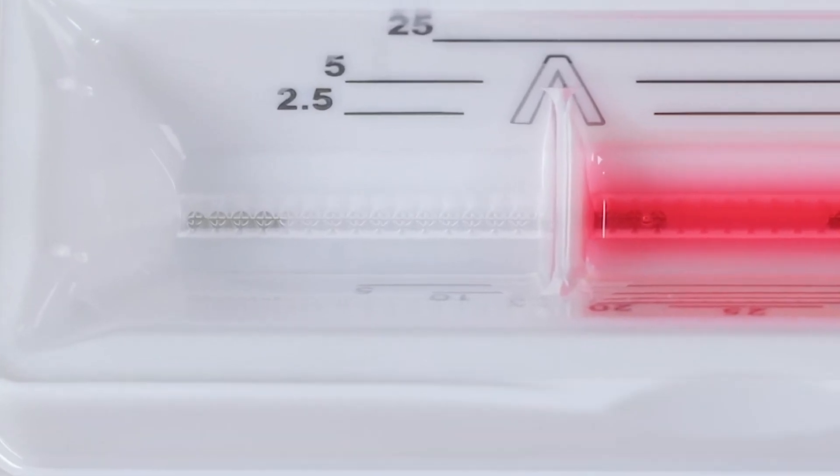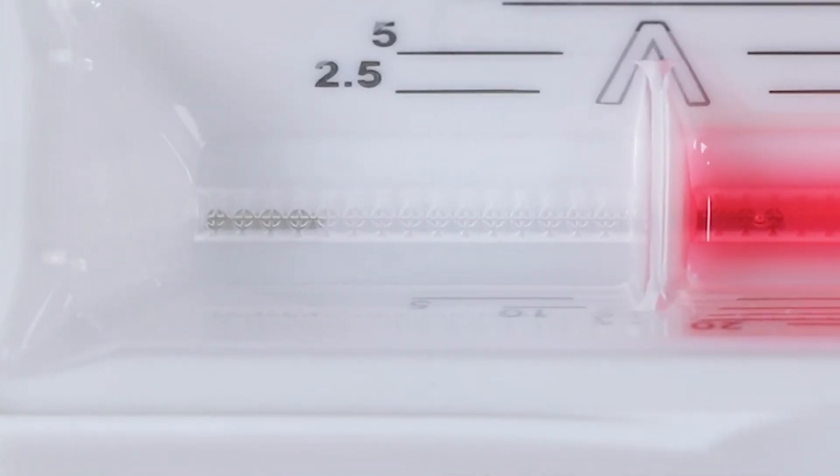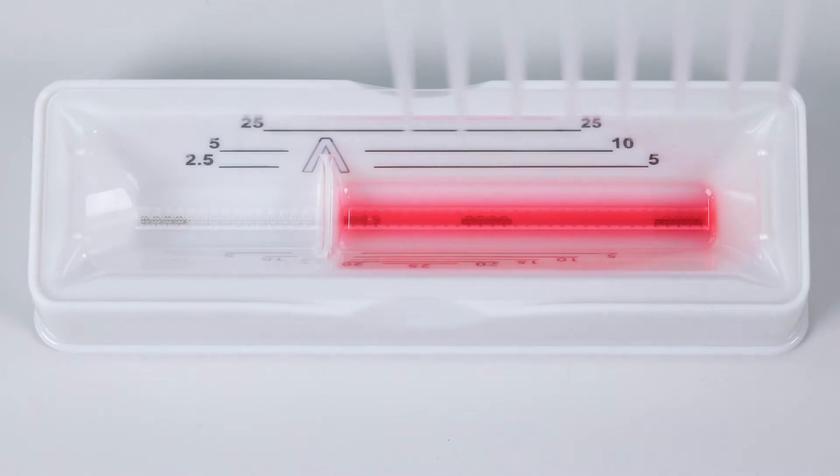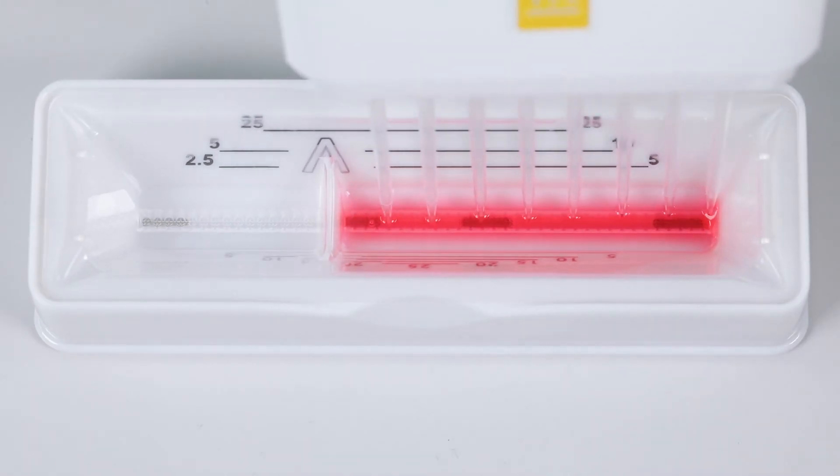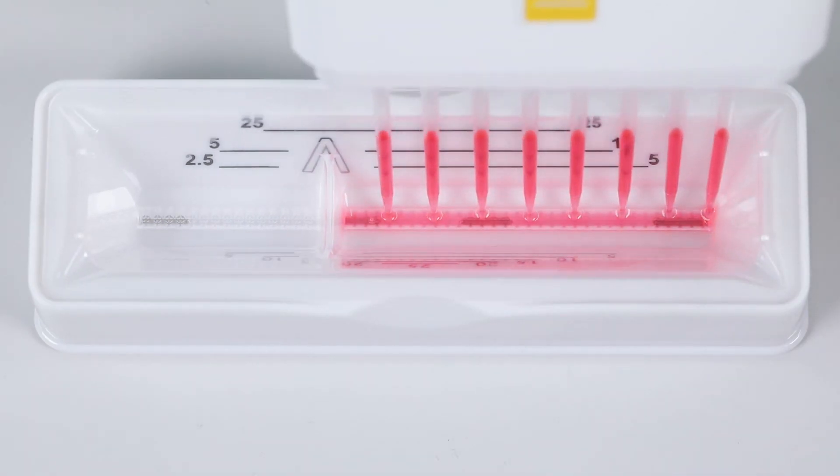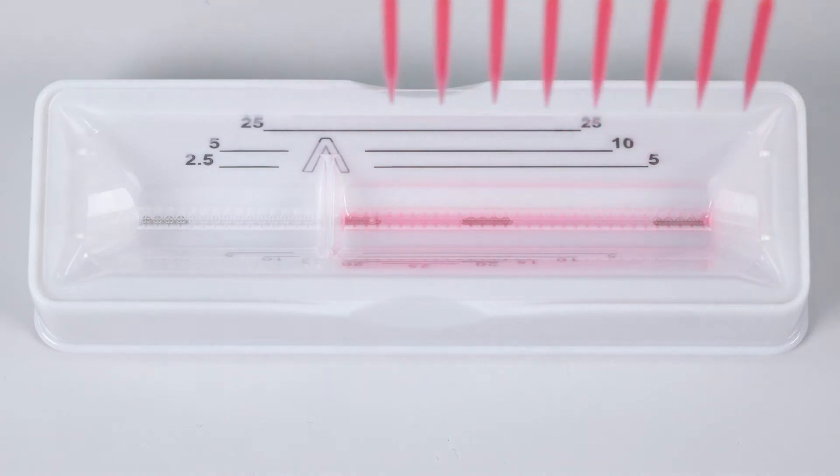The bottom of the reservoir features Integra's patented Sure Flow design, allowing pipette tips to sit firmly on the bottom. In combination with a hydrophilic treatment, liquid is spread evenly across the bottom for maximum recovery of your precious reagents.